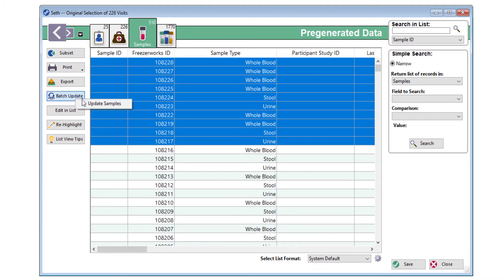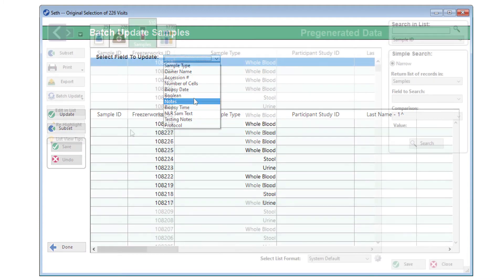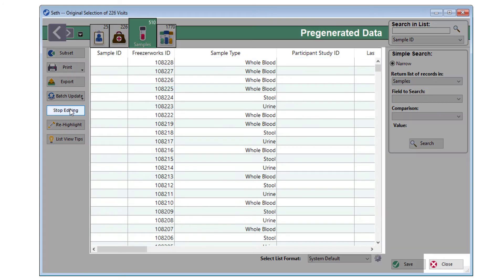This allows you to better prepare for receiving those kits, say if data has changed from the original visit model, or data simply wasn't modeled.